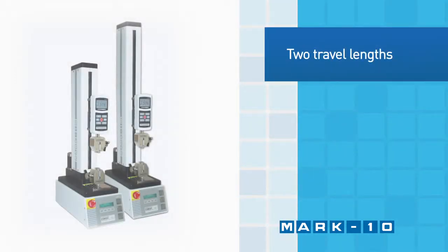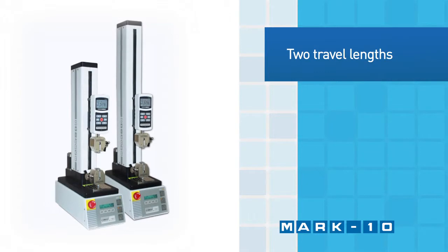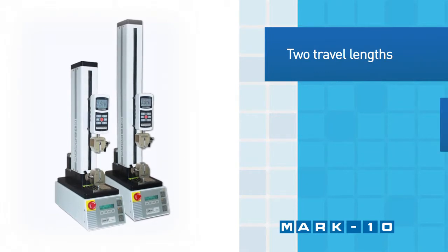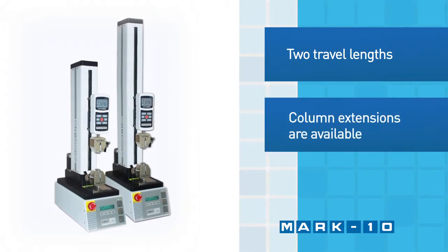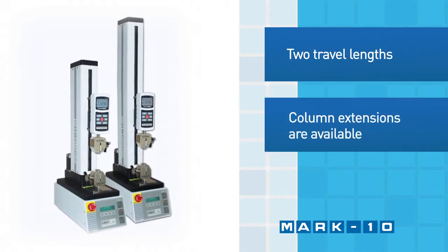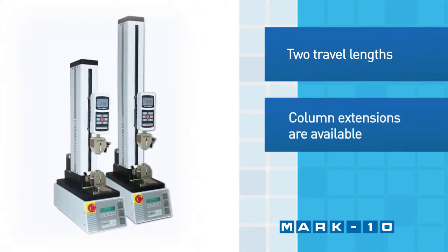Two travel lengths of the ESM 301 are offered and column extensions are available with both test stands for taller samples.